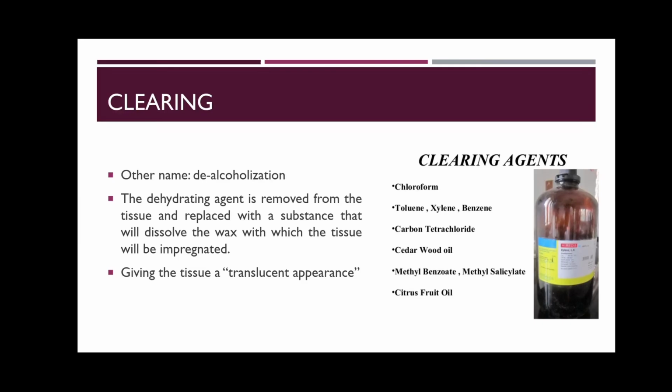The most common clearing agent that is used in the laboratories is xylene. So the clearing agent is xylene. So you already know three agents, right? For fixative, we have formalin. For dehydrating agent, we have ethyl alcohol in increasing grades. And for clearing agent, we have xylene.